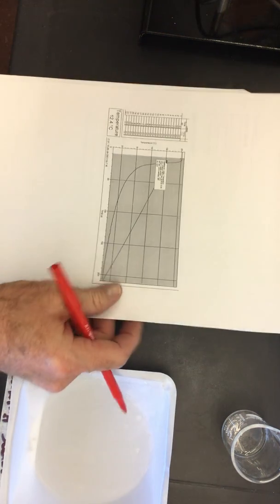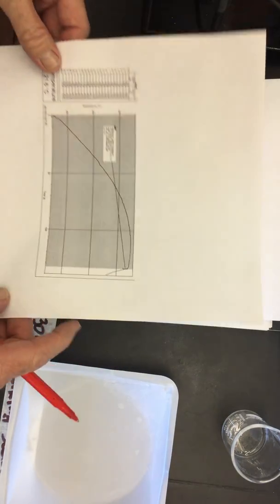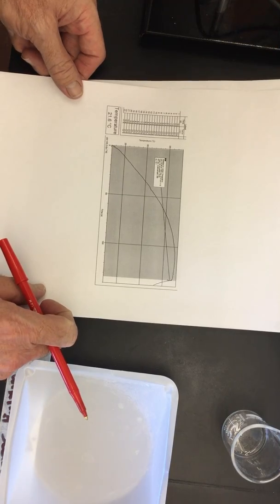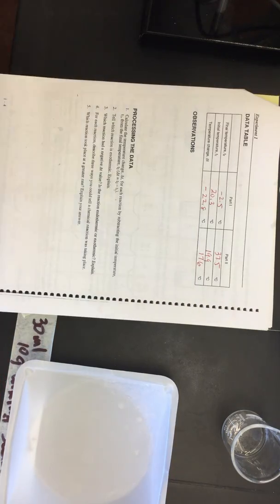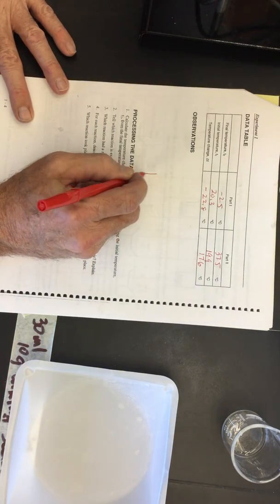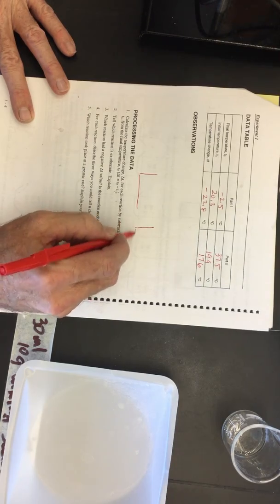So here's our first experiment, and I'd like to graph what that looks like. And then we also have the second one, which looks like this. Okay, so again, the first one looks like this. We're going to sketch this down below here. You can create a little XY axis and another XY axis for the other one.